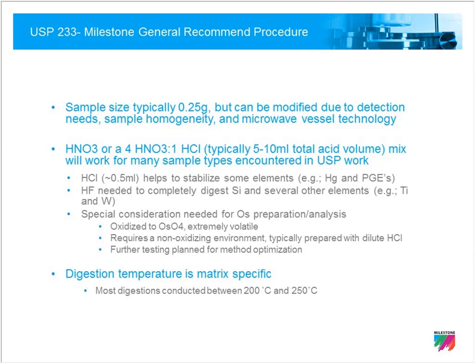The other nice thing about fluoroboric acid is that it helps with insoluble fluorides. Sometimes when you're using HF, or often when you're using HF, and you have elements such as aluminum, magnesium, and calcium at fairly high levels, insoluble fluorides are going to form. And what you typically have to do if that happens, to get a clear digestion, is have a second step in that process where boric acid would be added. Okay, and that's to help neutralize the HF. Here with fluoroboric, it's one step, and again, you don't have the safety concerns that you do when you use just HF.